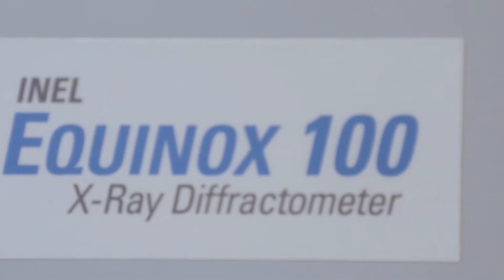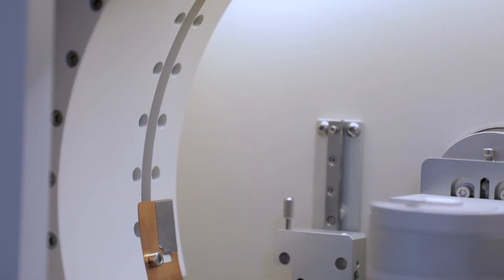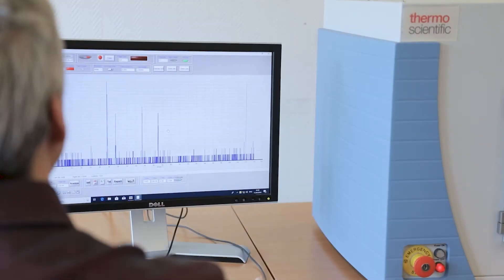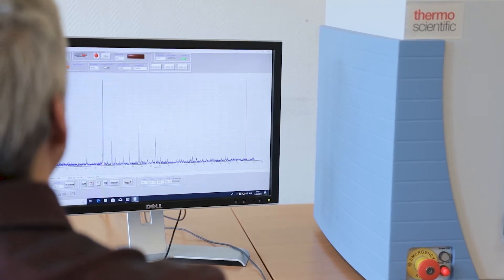The ARL Equinox 100 instrument features a unique curved position-sensitive detector for real-time simultaneous acquisition of the full diffraction pattern, enabling faster analysis, in situ experimentation, and monitoring the development of crystalline phases or observing phase transitions.